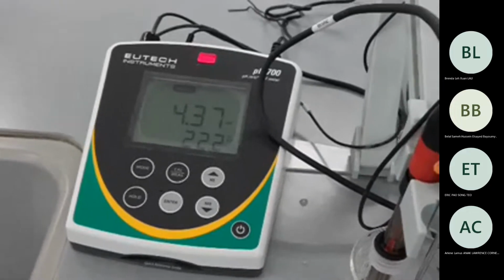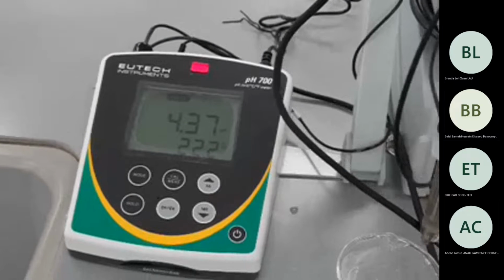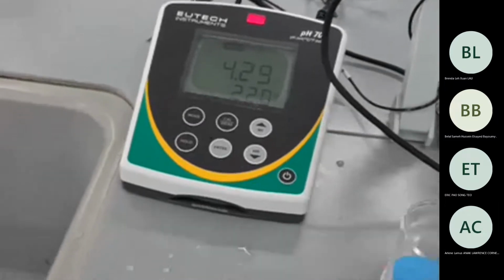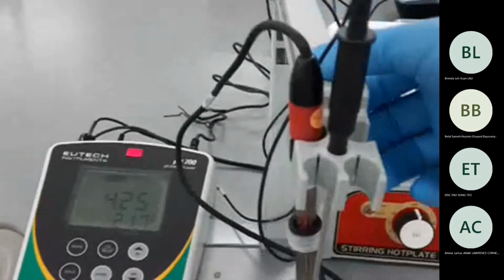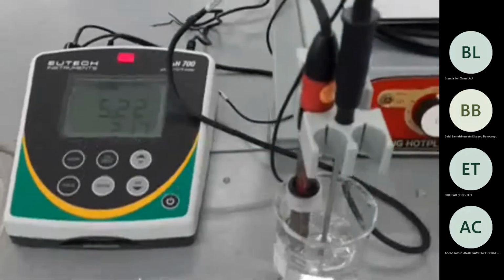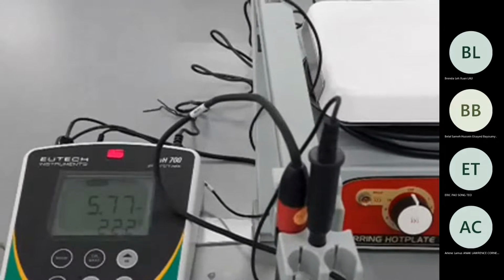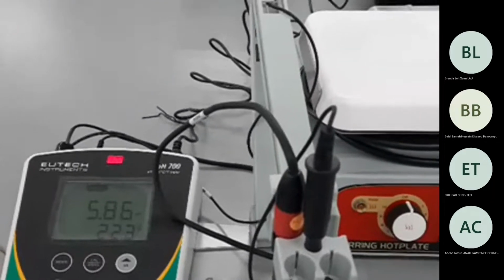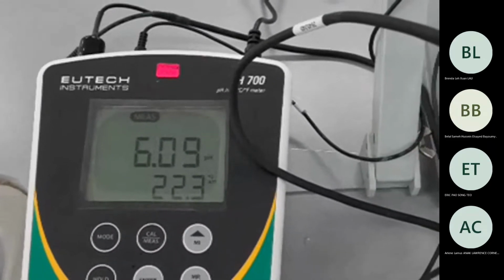All right. So now, since it is deionized or distilled water, I don't need to rinse it anyway. So I take the pH for tap water. The tap water is much higher. It's going around 6 now. 6.09.